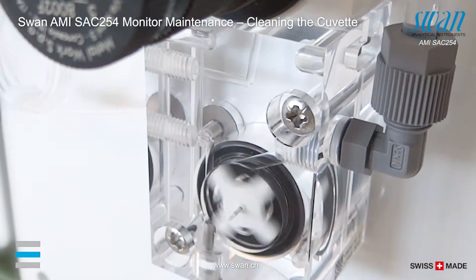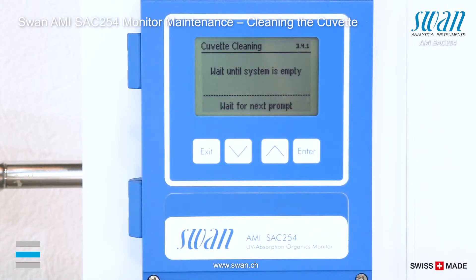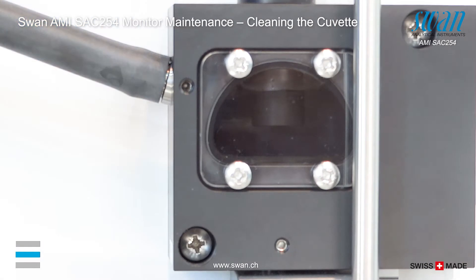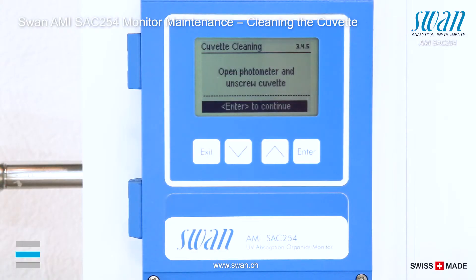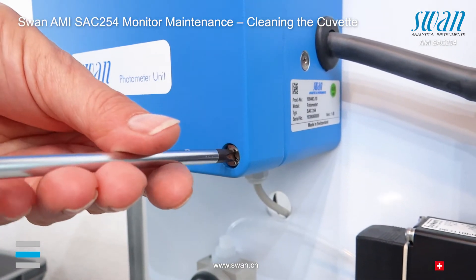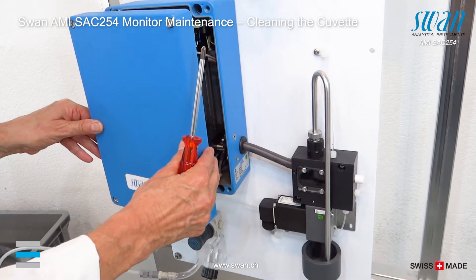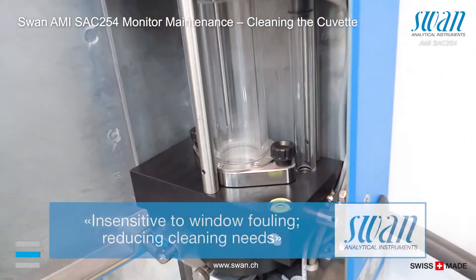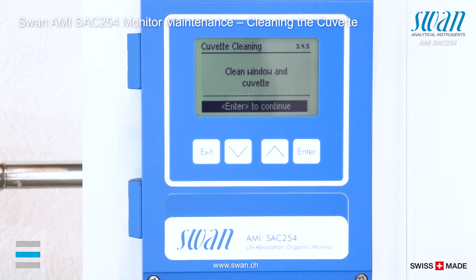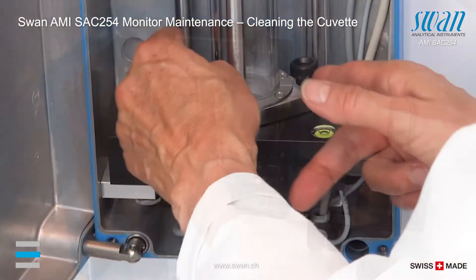To clean the cuvette, follow the instructions on the screen. Wait until the system has completed the automatic drainage. Open the photometer housing.